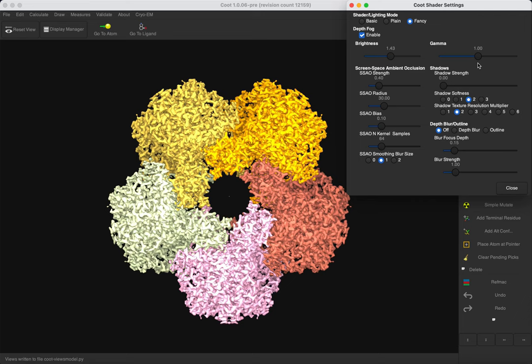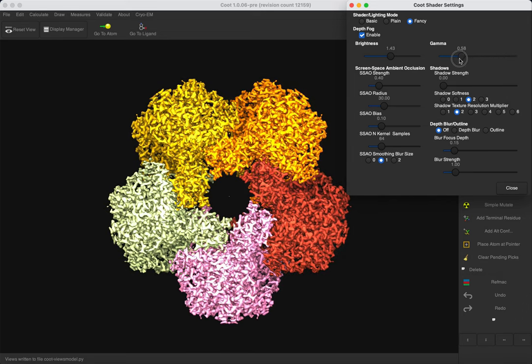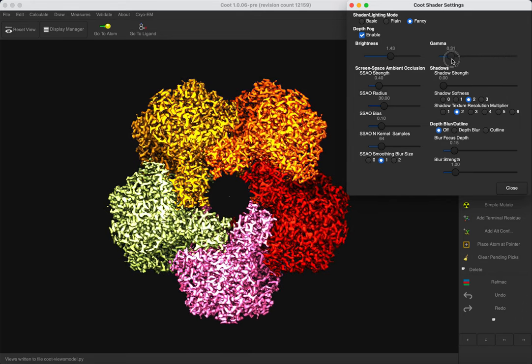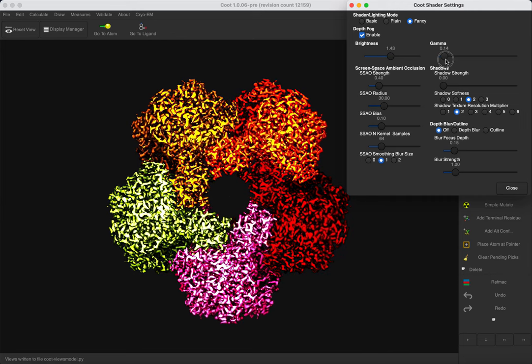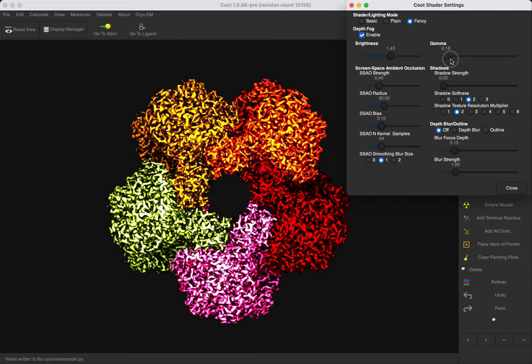There is also a gamma option, so that the colors component can be varied. High values of gamma make the image bright and pastel, and lower values make it darker and more saturated.